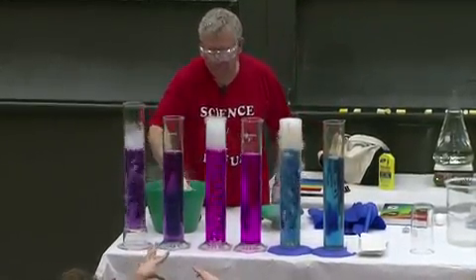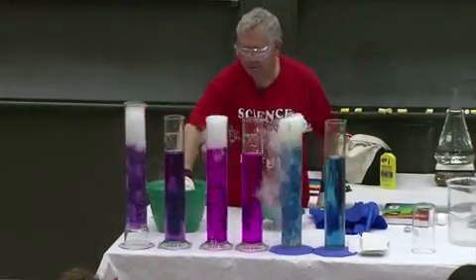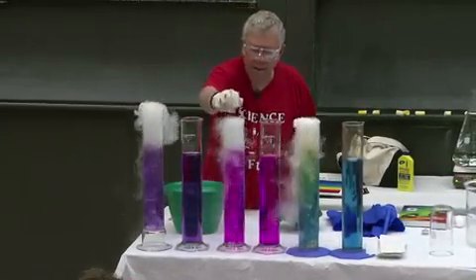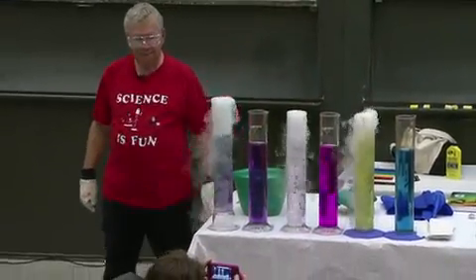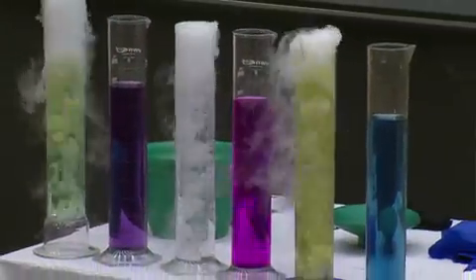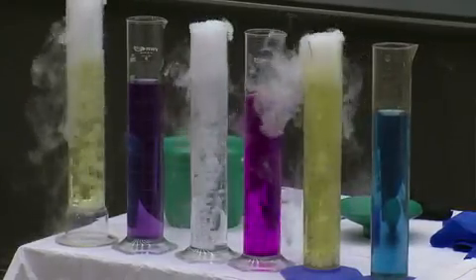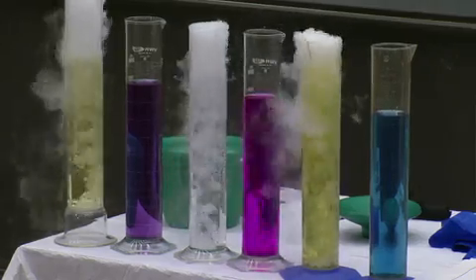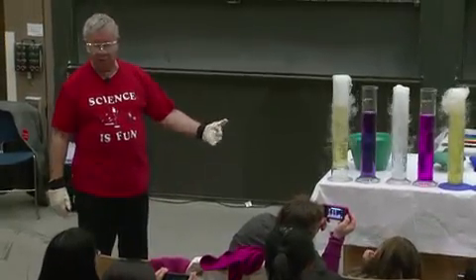It's blowing out. What's blowing out? You see any bubbles? What kind of bubbles are those? What, you want to know what's in there? You already know what's in there, but dry ice. I put the dry ice in there. What did I put the dry ice into? Into cylinders that have colored liquids in them, right? And I put the dry ice in every other cylinder. I didn't put it in every cylinder, right? Every other cylinder, leaving one for comparison purposes.